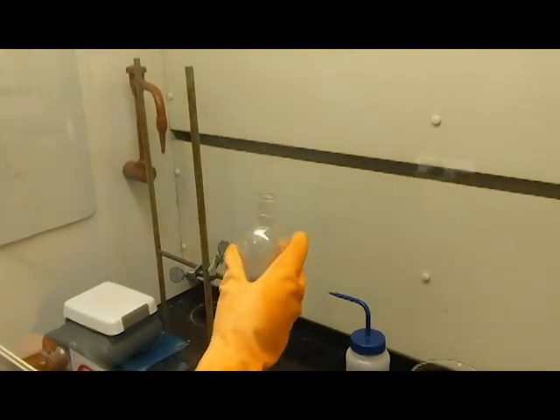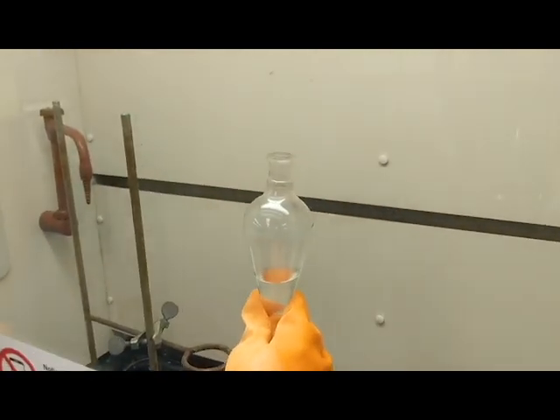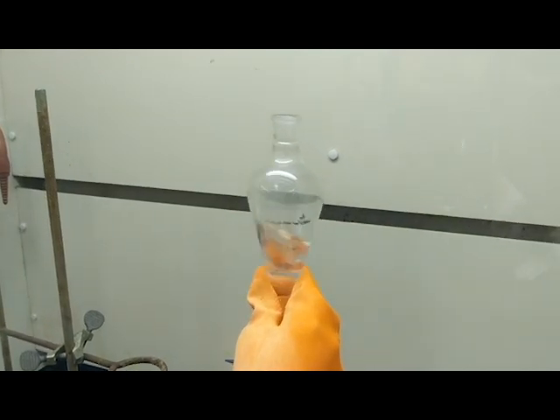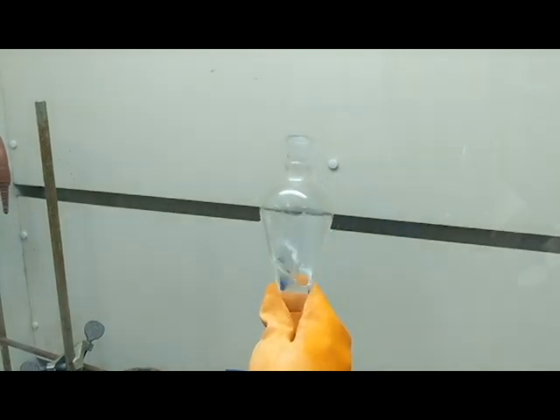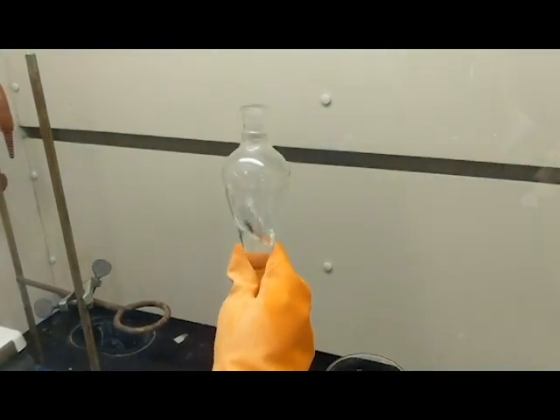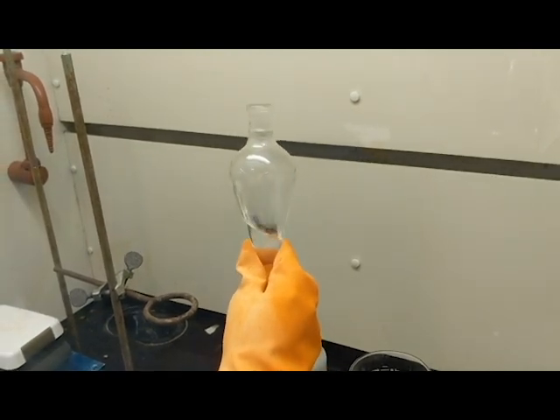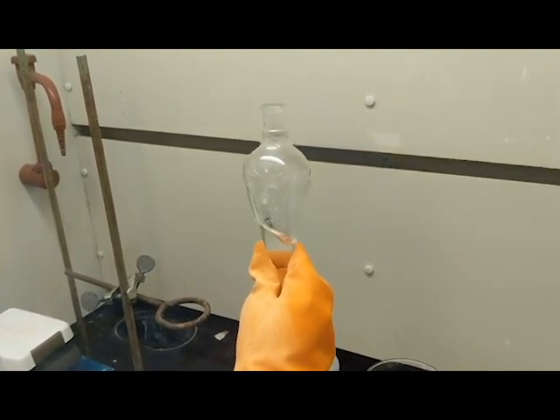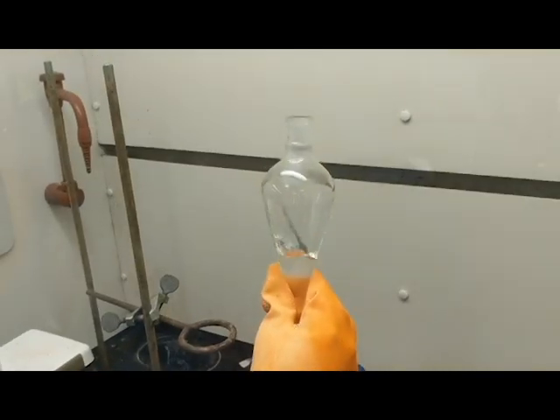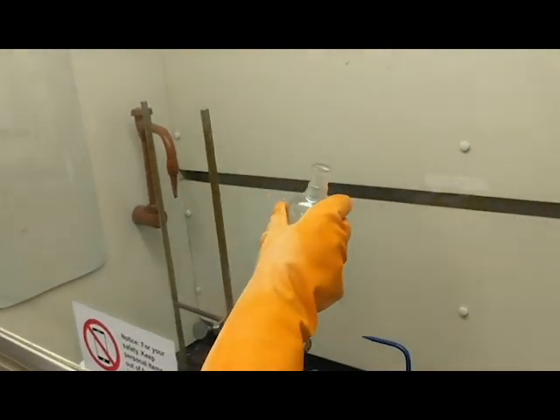So your procedure next tells you that hydrochloric acid has a very high vapor pressure. And because of that, I'm going to start this experiment by swirling the contents inside carefully, making sure that the solutions are mixing, without the cap. That's important because if you forget, that cap will pop off because the pressure inside will be so great it will force the cap out. So we're going to do this for approximately 1 minute, and we do not have to time it. This is just an estimate. So that's approximately 1 minute. And now I'm going to return it back to the ring stand.